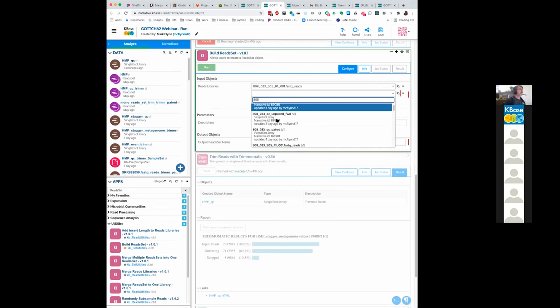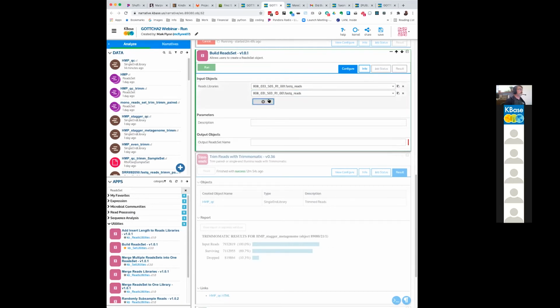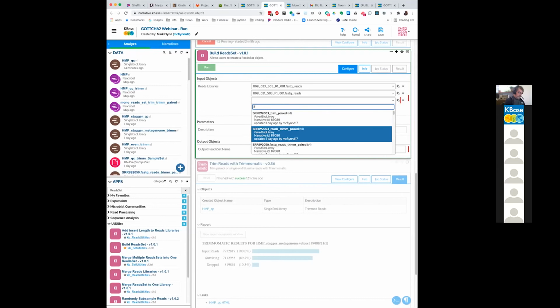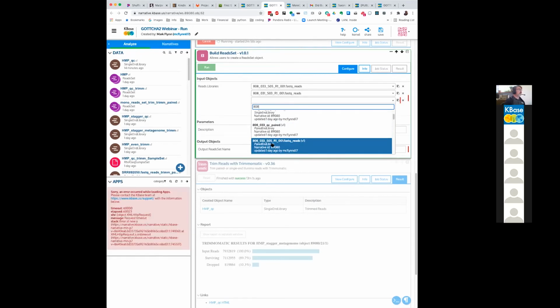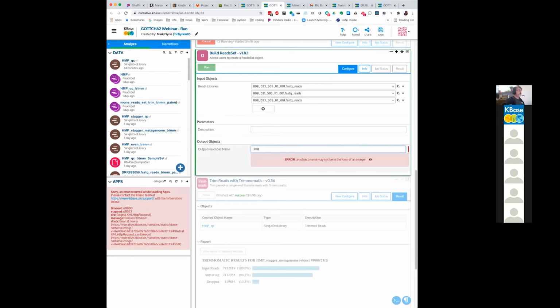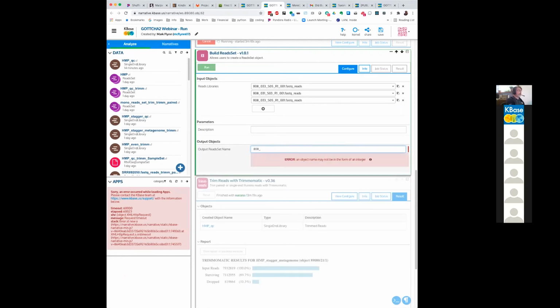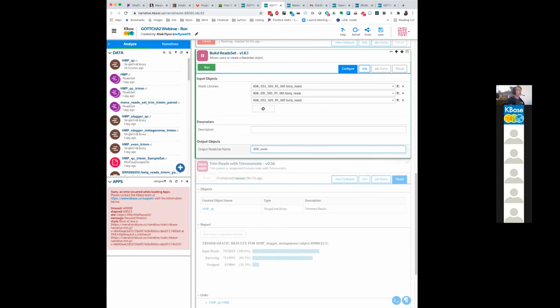And you can use their handy search tool to find them. Okay. And then you give it a name, and then you click run.